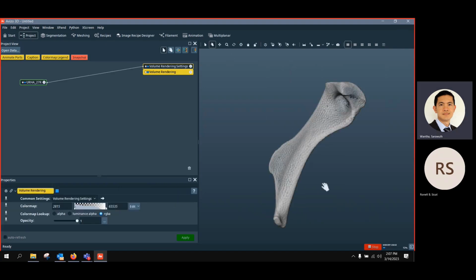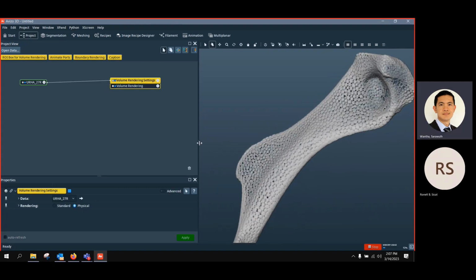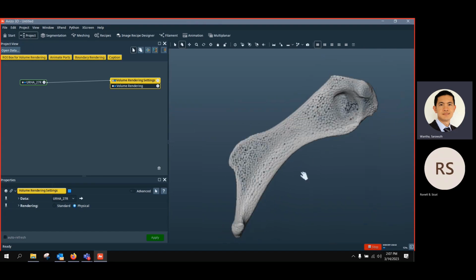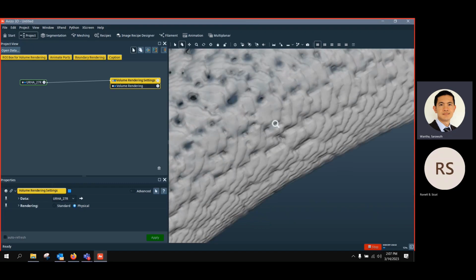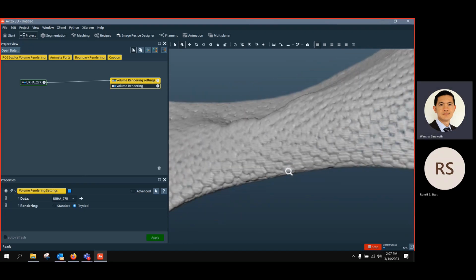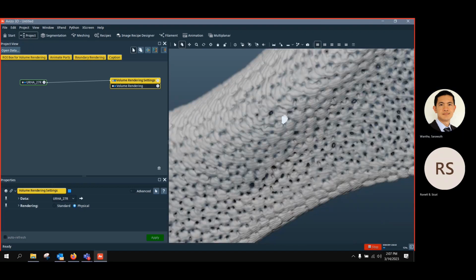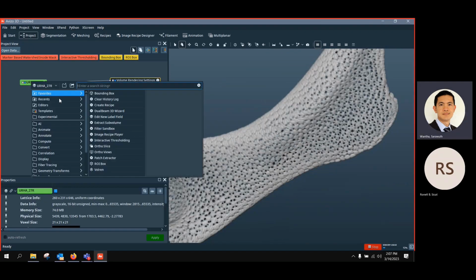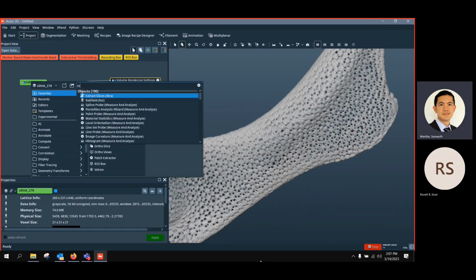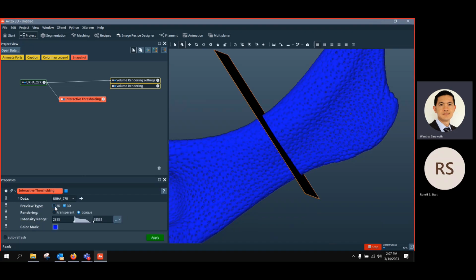If you open the file, it looks like this. It's the mandibular bone of a stingray, and you can see the part of this bone they call tesserae. The aim here is to separate them, and using normal object separation with watershed segmentation, sometimes it's difficult and we don't obtain very good results. So I'll show you quickly here. I do interactive thresholding and look at it in 3D. Yeah, should be okay. Maybe even like this.